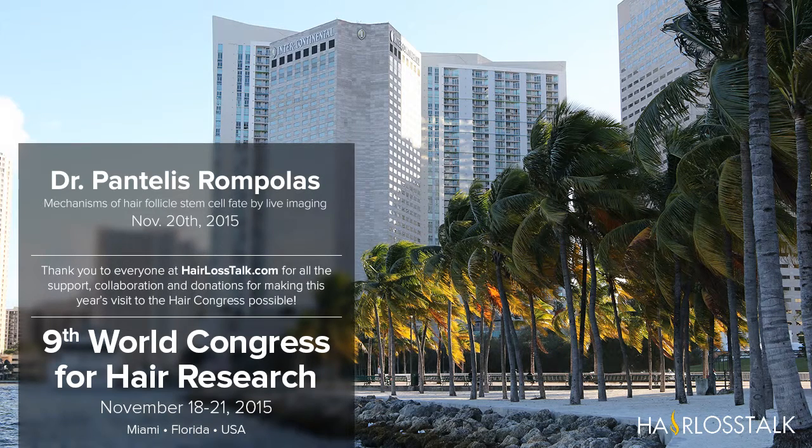And I should just point out that in this experiment, when we activate the reporter, essentially we label the cells in the entire volume of the hair follicle. So we label the cells both in the outer root sheath and the inner layers. And in this example here, you can see the separation of the two lineages. You can see cells here that were part of the inner root sheath and the hair shaft being extruded.